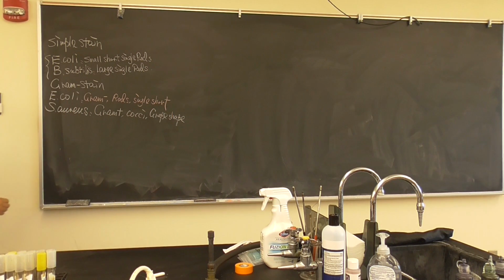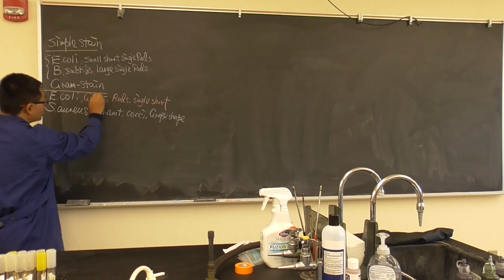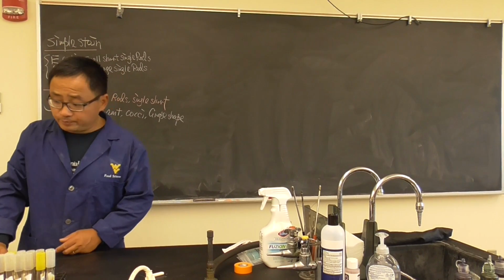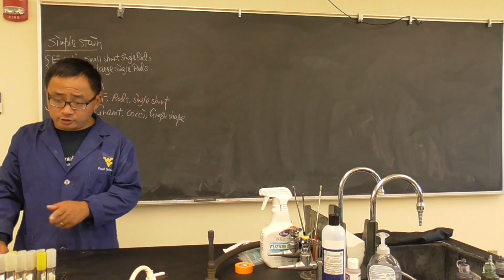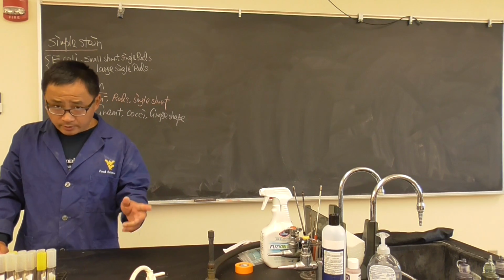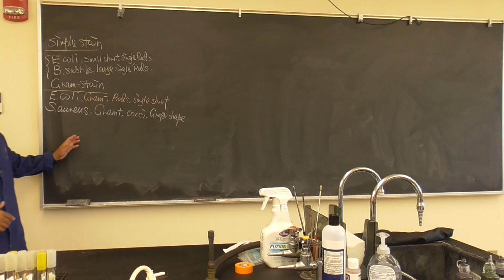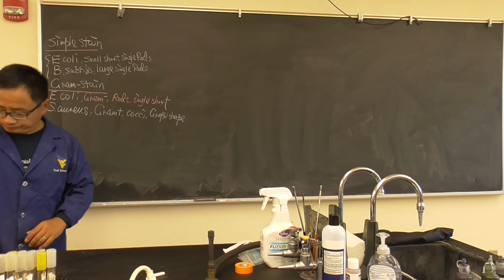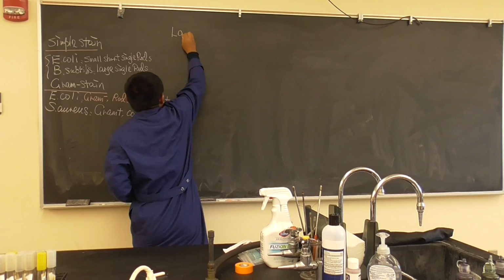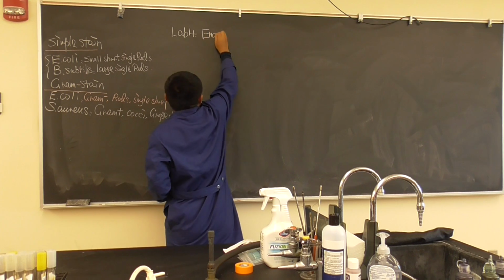So these are the things you should record in your notebook, and it is also better to have a picture to show what you did. I believe in the lab manual, if you look at the color PDF version on eCampus, you can see the results there. I put the results there already. Okay, so this is what we did already. And today we will move on to lab 4, another major stain, which is called the endospore stain.